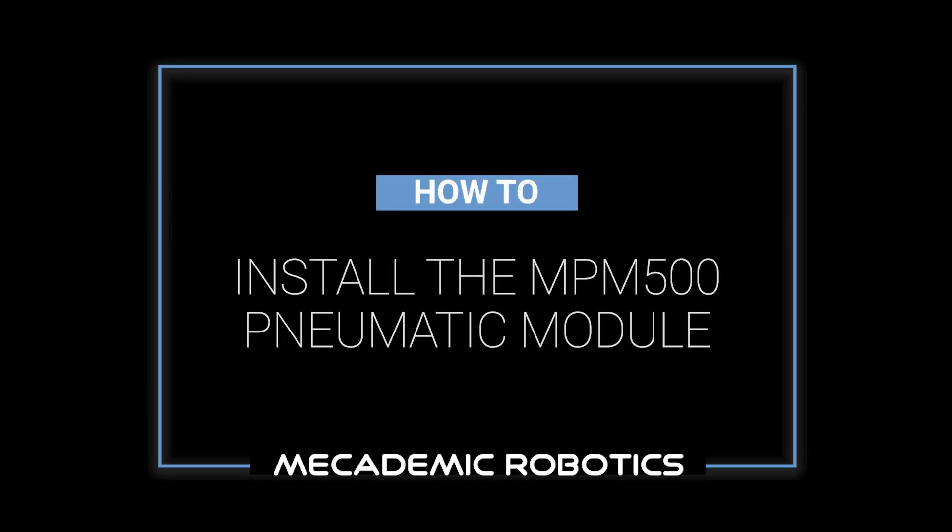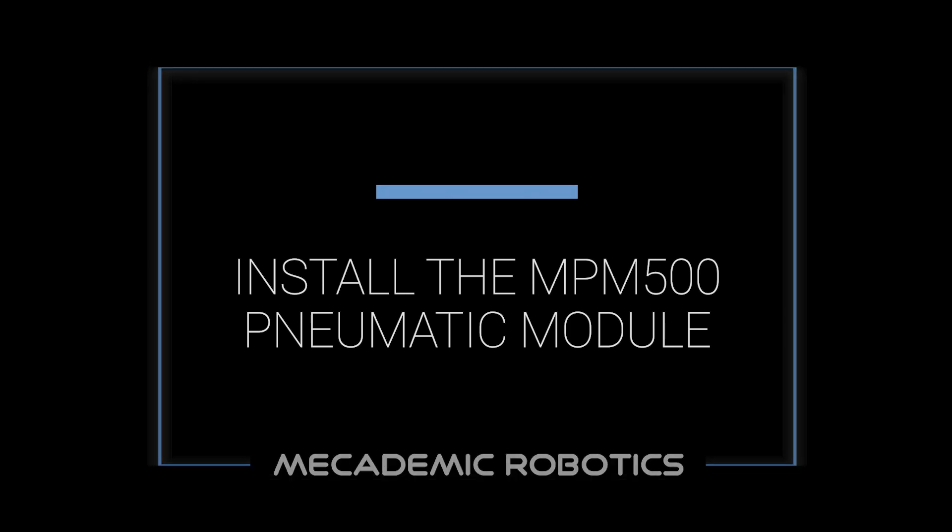The MPM500 pneumatic module is simple to install and use with the Meca500 industrial robot. Before installing the module, it is important to power off the Meca500 robot.